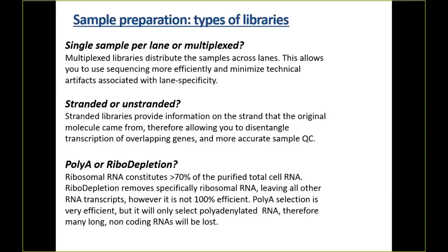So with poly-A, you're not just selecting for mRNAs, you're selecting for the 3' end of messenger RNAs. And in this case, this lab really wanted to see if there was some kind of a truncated form of their gene being made. And their gene had a transcript of over 10,000 bases. And what I saw when I looked at their data was everything. So they did poly-A pull down, and I told them, I can basically see just the 3' end of your gene, but when you're dealing with a 10,000 base mRNA, it's going to break somewhere during processing.